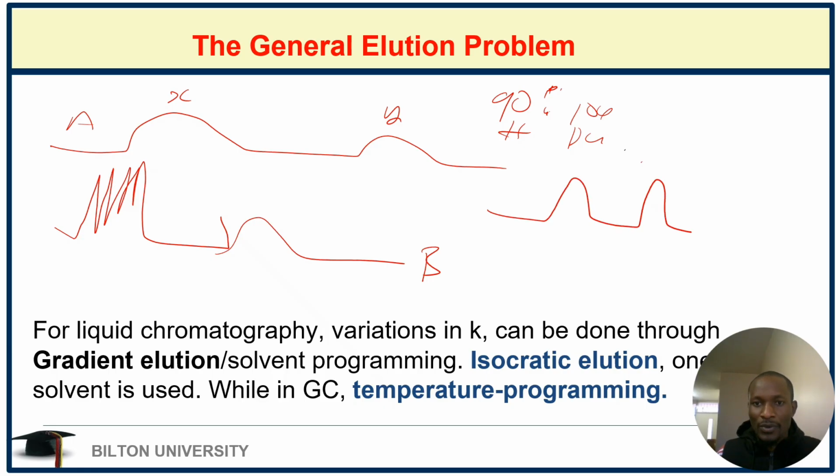You are still not comfortable, and then you change the solvent system to maybe 70% hexane and 30% DCM. This is still like this.